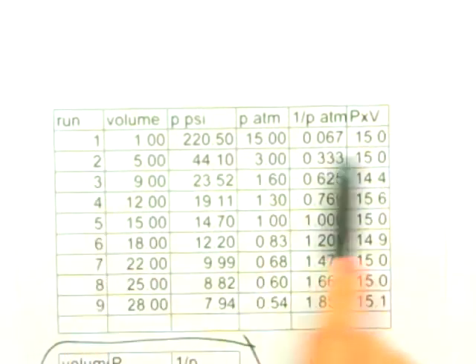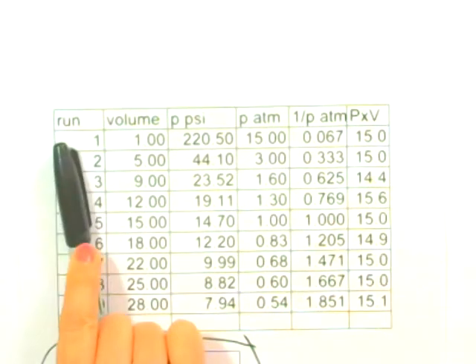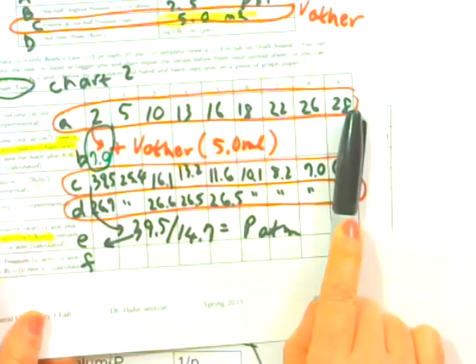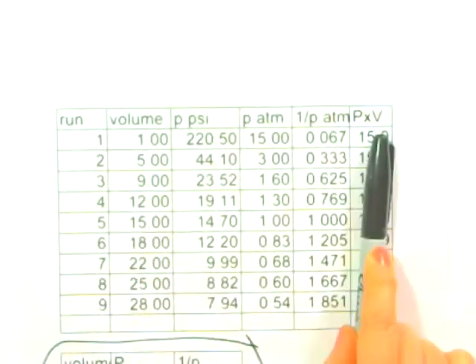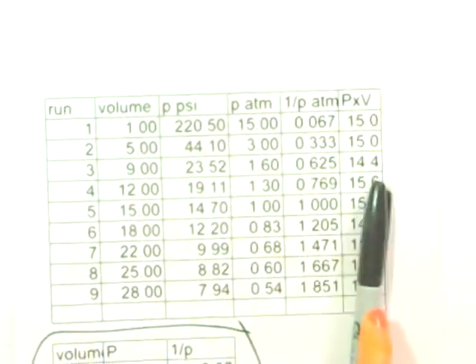I also have this on the Excel spreadsheet plot that I have on my website. I haven't put it up there yet, but it'll be up there soon. This top part is actually what shows up in this part of the chart. I just put it here. This data does not match the data that I gave you for your class, but it's very similar because it's the same sort of experiment with the same equipment.